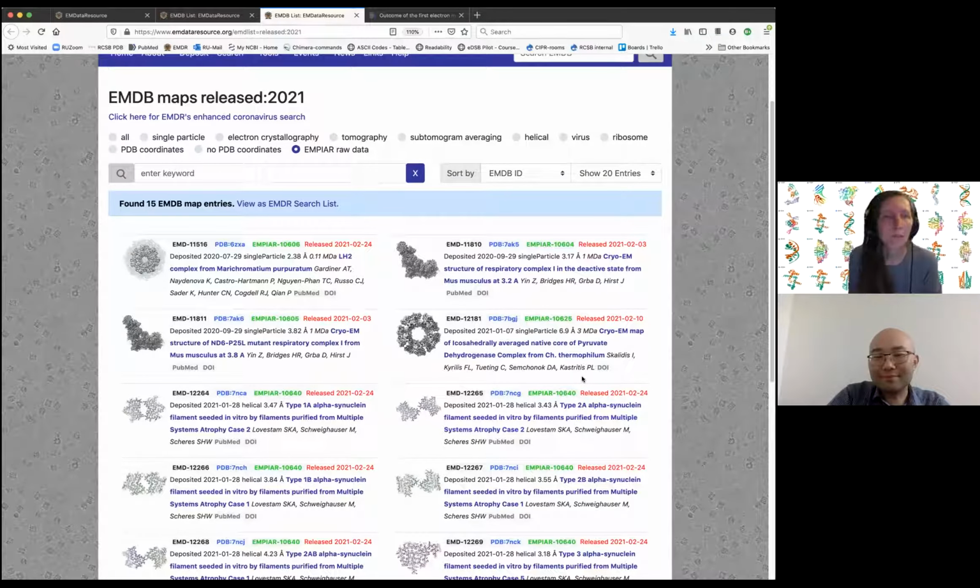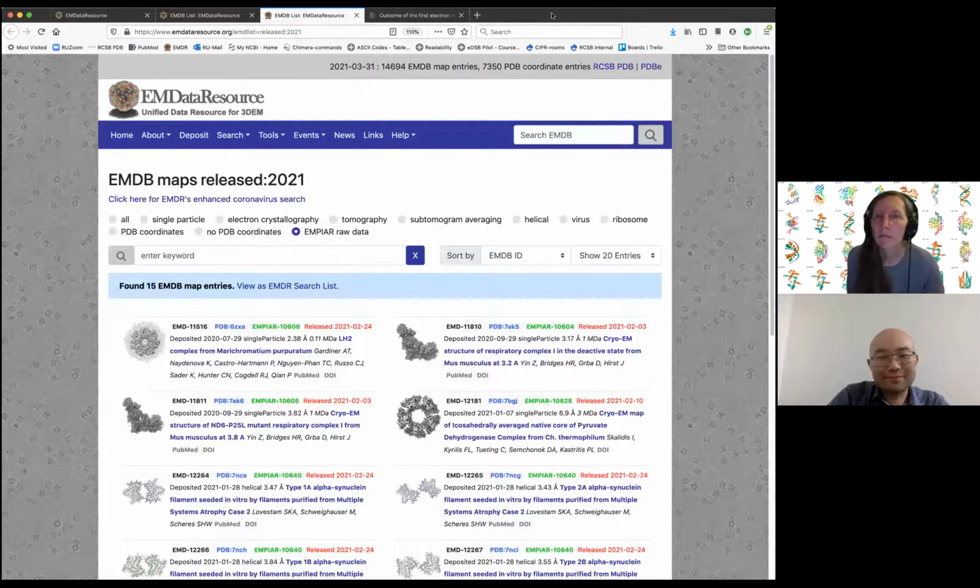I have another question. When you do the deposition, it generates a validation report. Is that generated with Phenix or with another program? That's a great question. So wwPDB has its own software package for creating the validation report. That said, it uses a number of different software packages to do it.